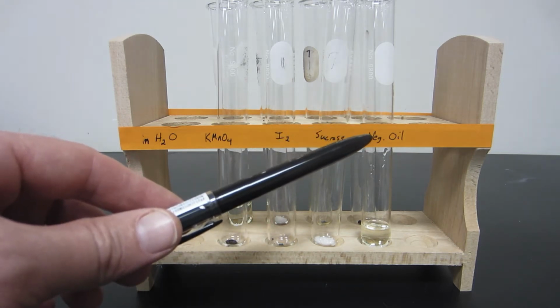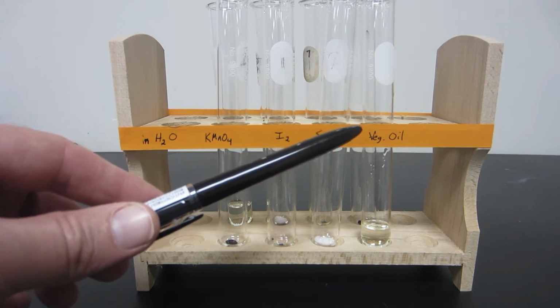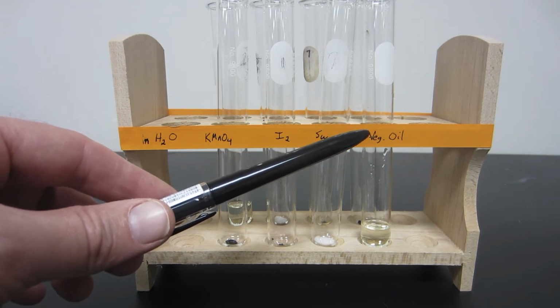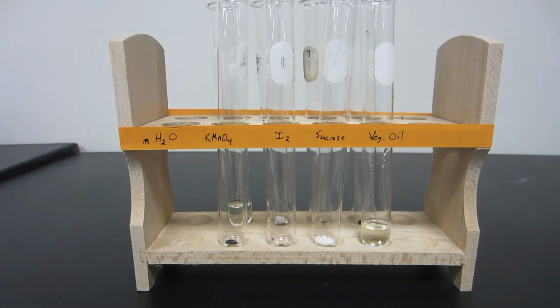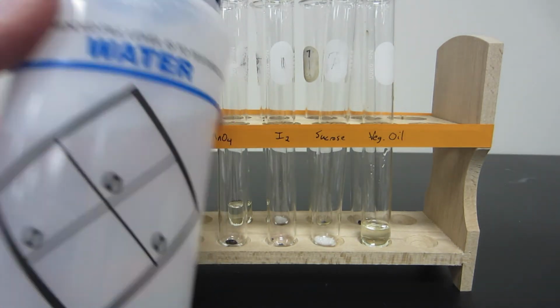Vegetable oil is very similar, not exactly the same, to a hydrocarbon. There's a lot of carbons and hydrogens there. It's primarily nonpolar. So we can anticipate what the solubility trends are going to be for vegetable oil as well.